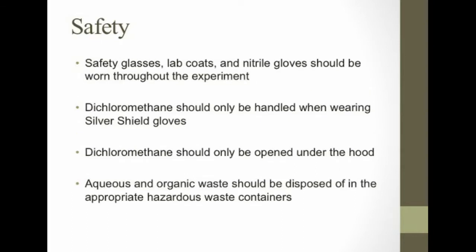Safety glasses, lab coats, and nitrile gloves should be worn throughout this entire experiment. Only handle dichloromethane when wearing silver shield gloves, and only open dichloromethane under the hood. Aqueous and organic waste should be disposed of in the appropriate waste containers.